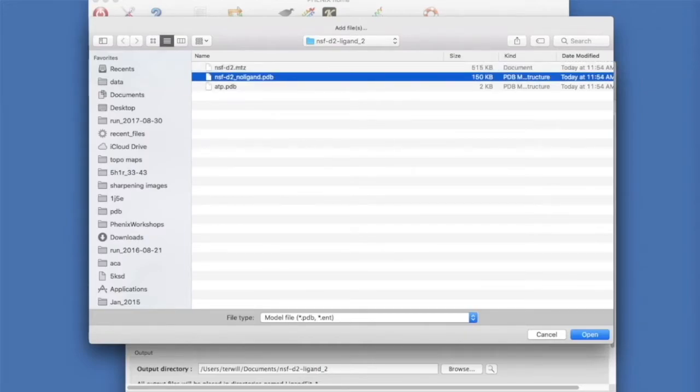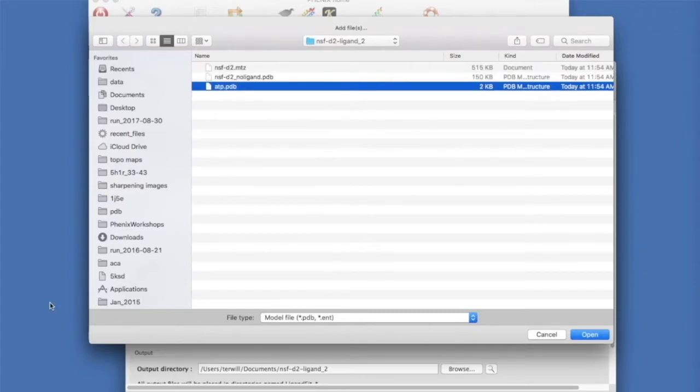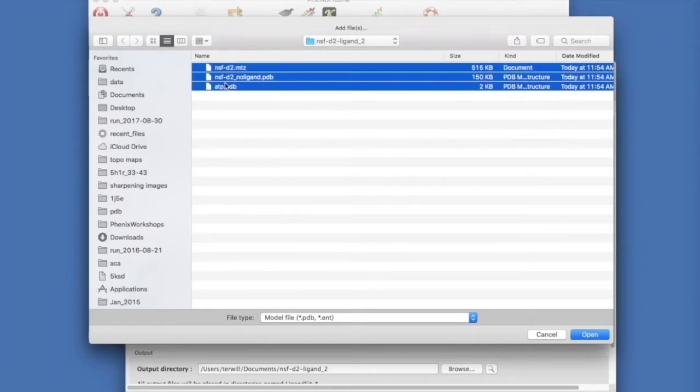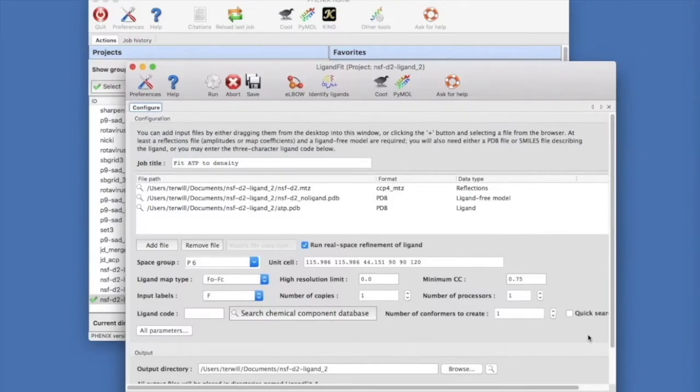NSF D2 NoLigand.PDB is just the protein. ATP.PDB is just the ligand in an arbitrary configuration. Select all three and click Open and the three files will be imported into the Ligand Fit GUI.